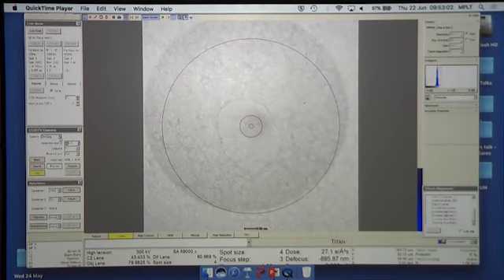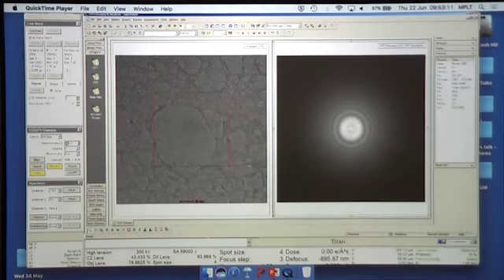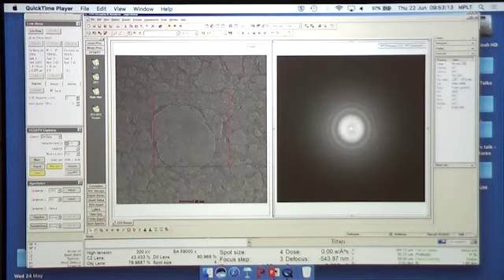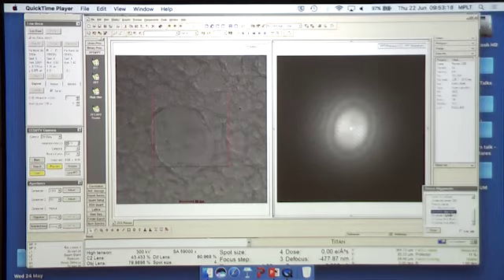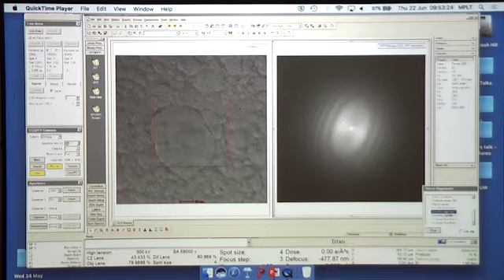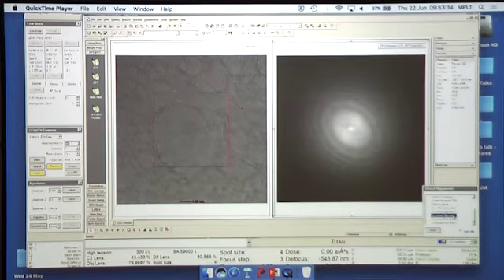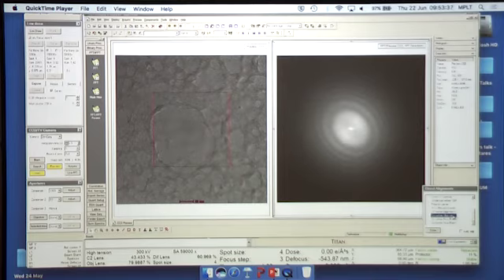Good. So then we switch to the CCD camera and select the theta here so we can look at the Thon rings to do the coma-free. So here the rotation center wasn't perfect. So you're going to see the difference. The coma-free was actually a little bit off. So you can see the two FFTs are quite different. And then gradually, as we adjust multifunction X, they start to converge. Then go to Y, because if Y is bad, it also affects X. So go back and forth a few times. So eventually, we've got them to where they're looking the same.